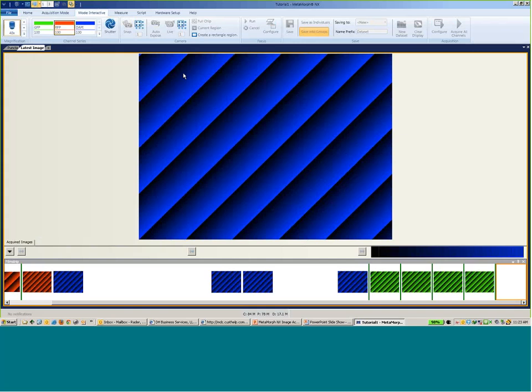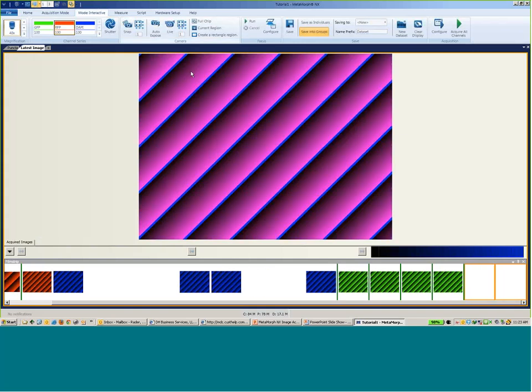Additionally, if I wanted to have more control on certain things, that's what the configure option gives you. So if you expand out the time, I can add a second time series. So if I wanted to do every 2 seconds for, say, 1 minute, change that to every 2 seconds for 1 minute.